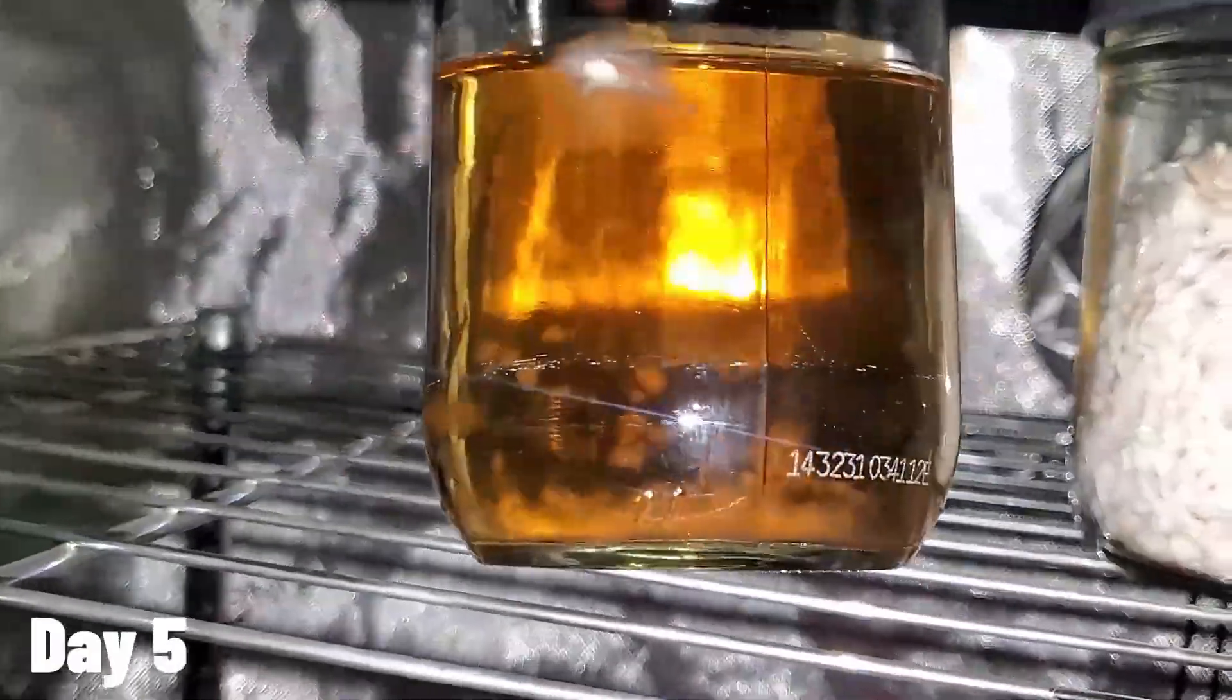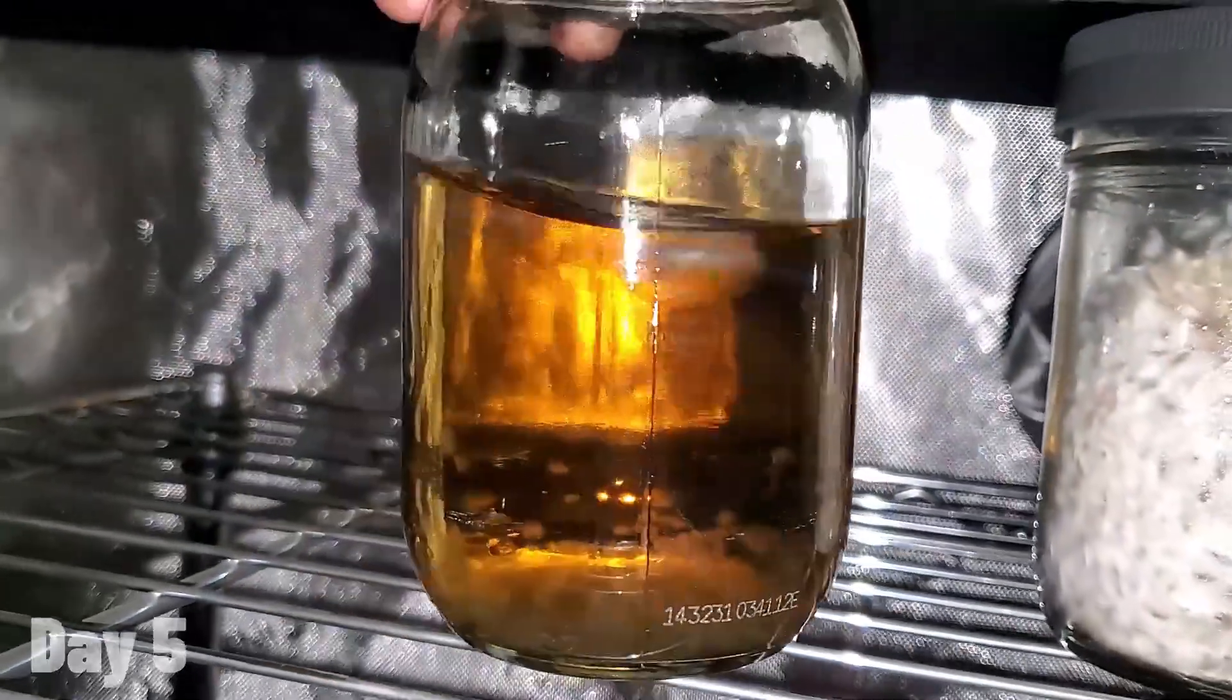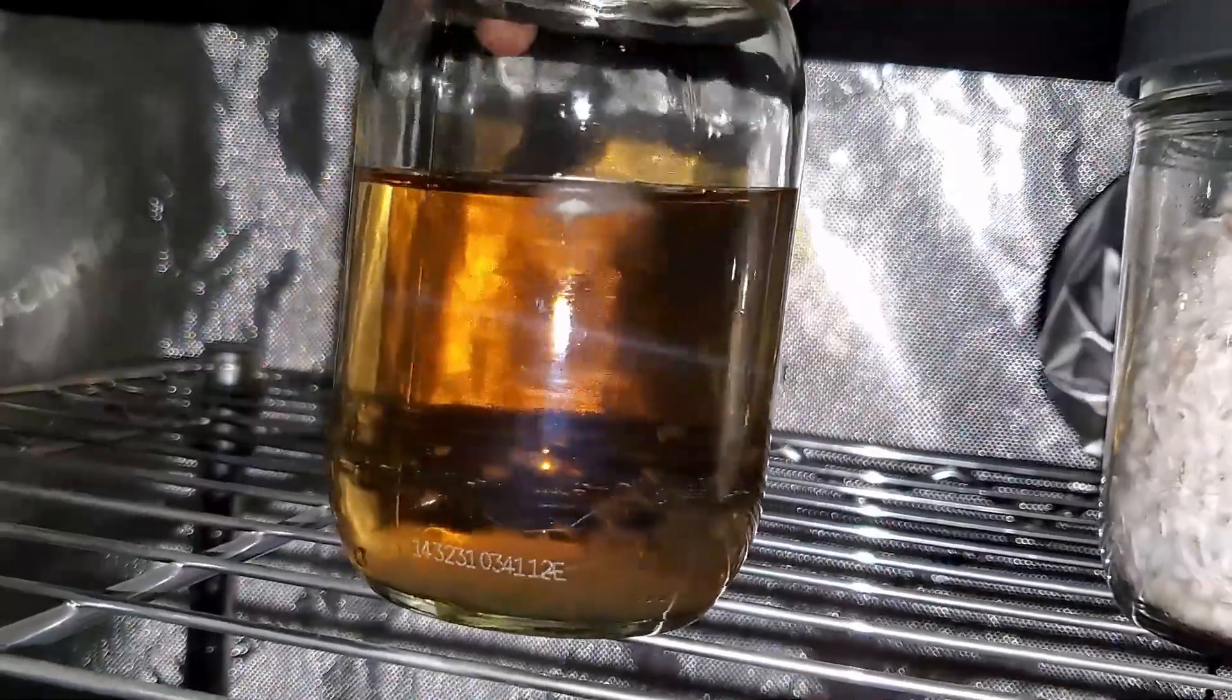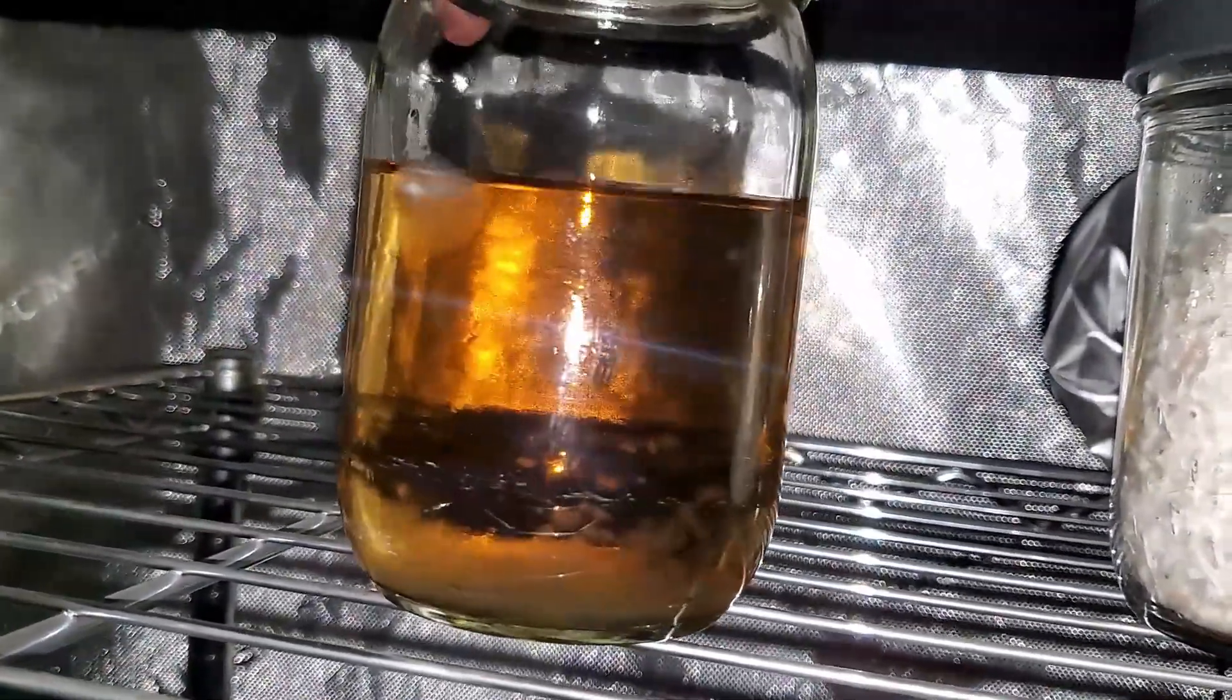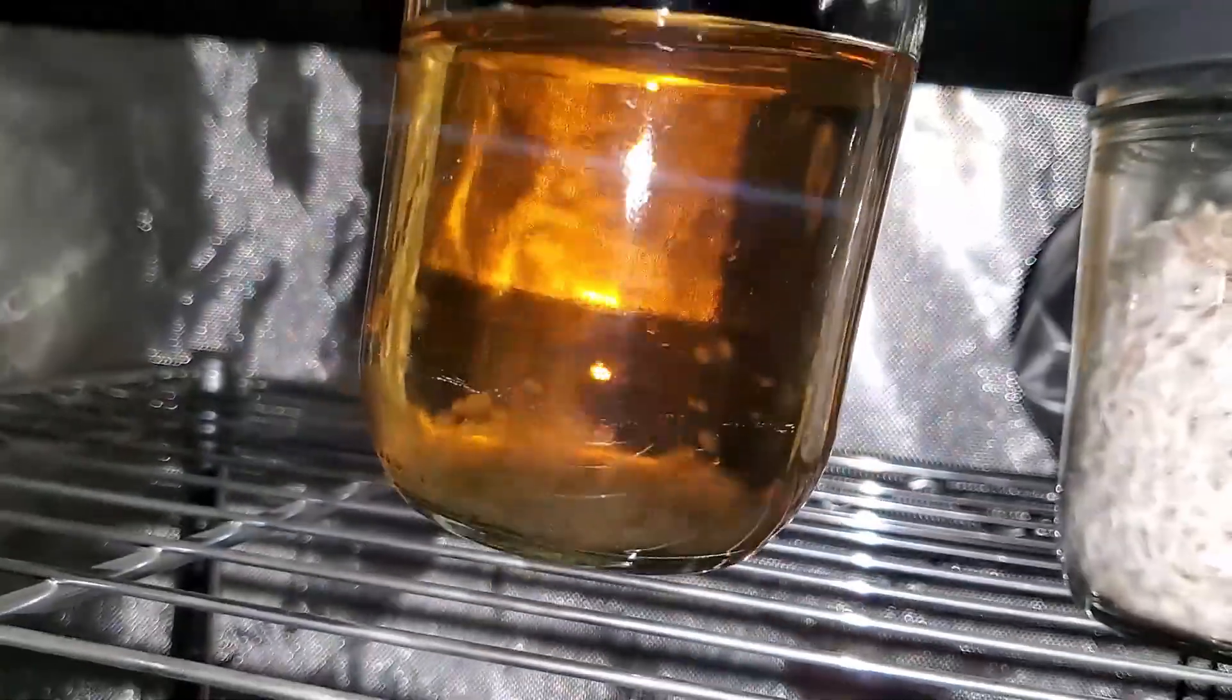So now it's five days later, and if you look inside the jar, you can see that the mycelium has already started forming. You can see it floating inside of there, and then there's a little fuzzy patch on top right there. That's all mycelium that started to form.